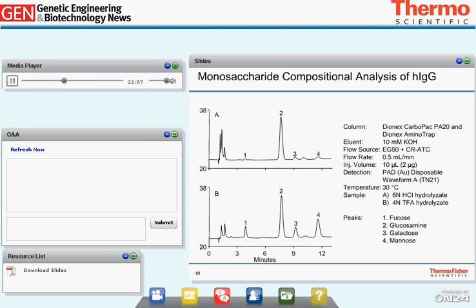This shows a separation of monosaccharides from human IgG injecting only 2 micrograms — recall that IgG is a very lightly glycosylated glycoprotein requiring more sample than most. Chromatogram A (HCl hydrolysis) shows only glucosamine, confirming N-glycosylation only with no O-glycosylation. Chromatogram B (TFA hydrolysis) shows fucose, glucosamine, galactose, and mannose with good-sized, easily quantifiable peaks. A small amount of glucose is also observed due to its ubiquitous nature in hydrolysis conditions.